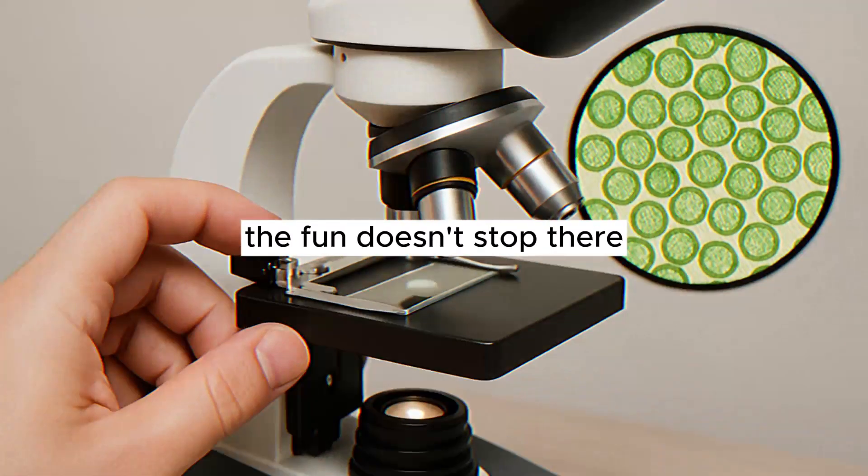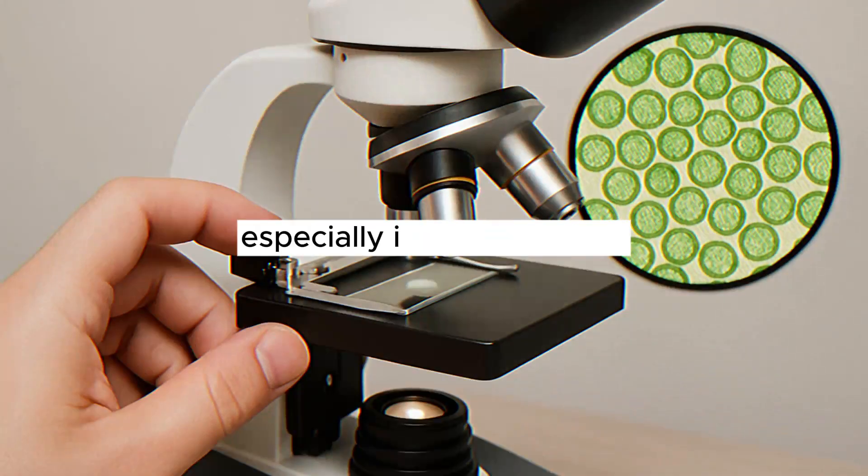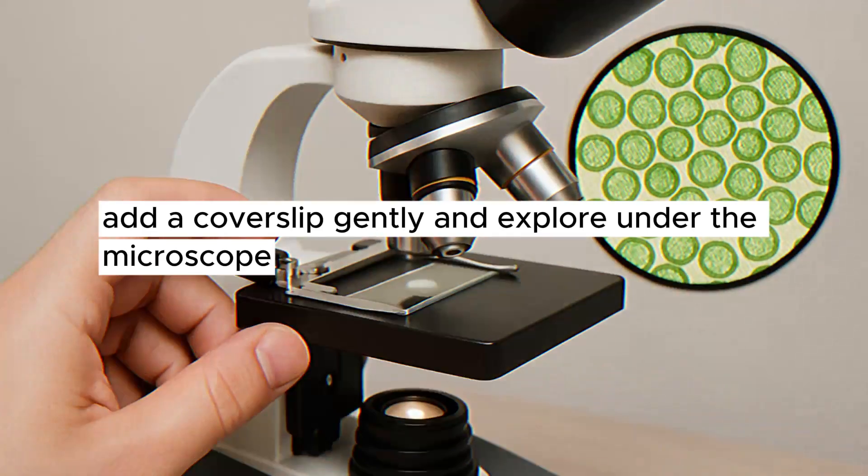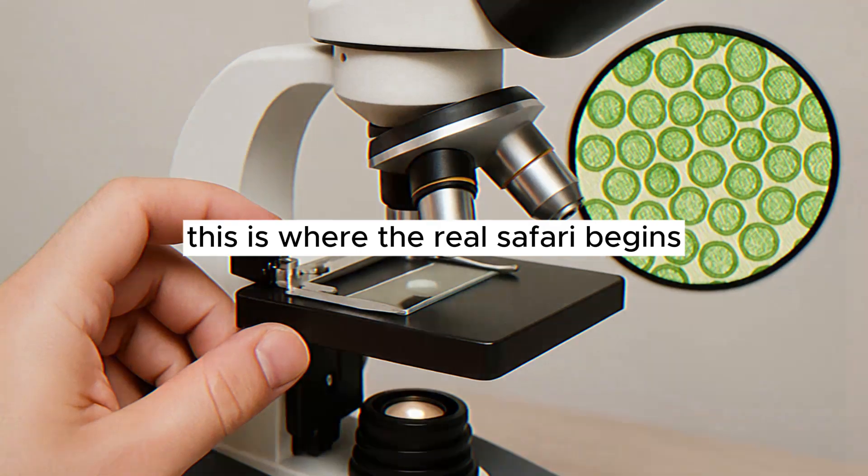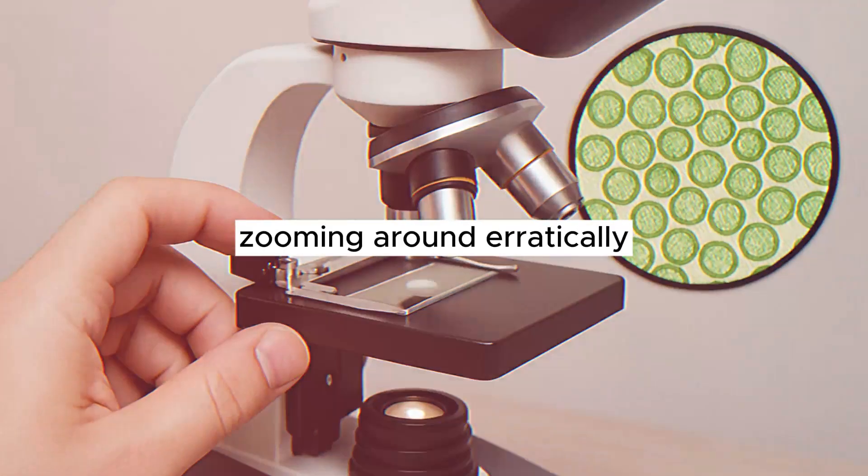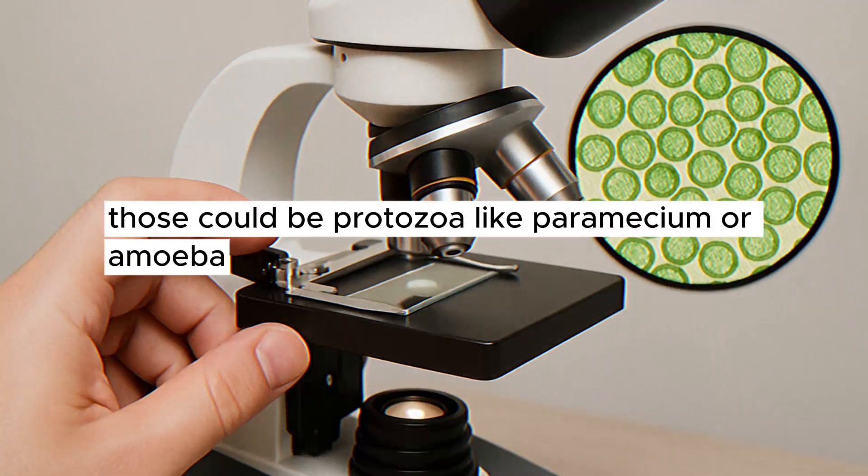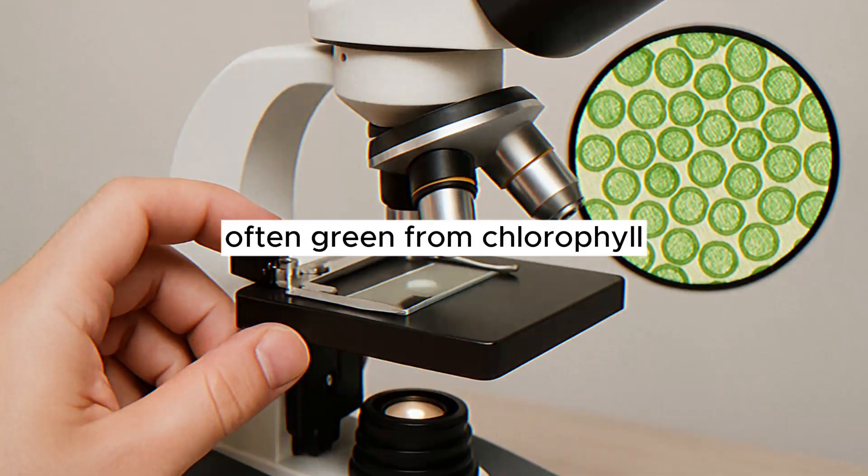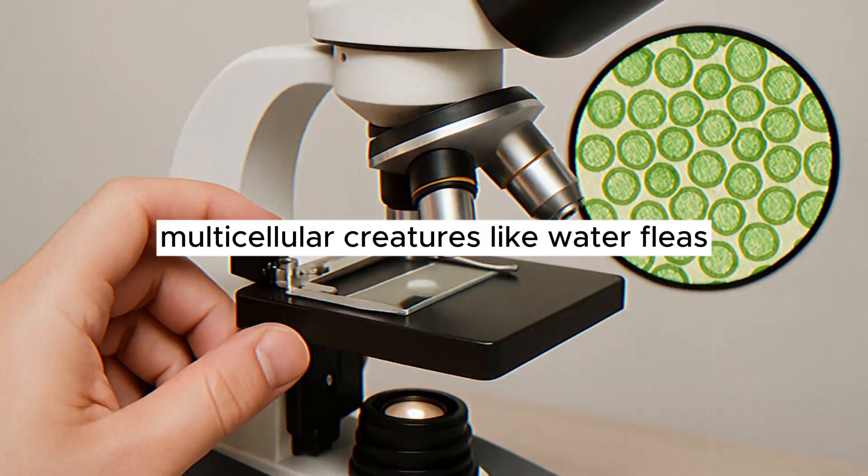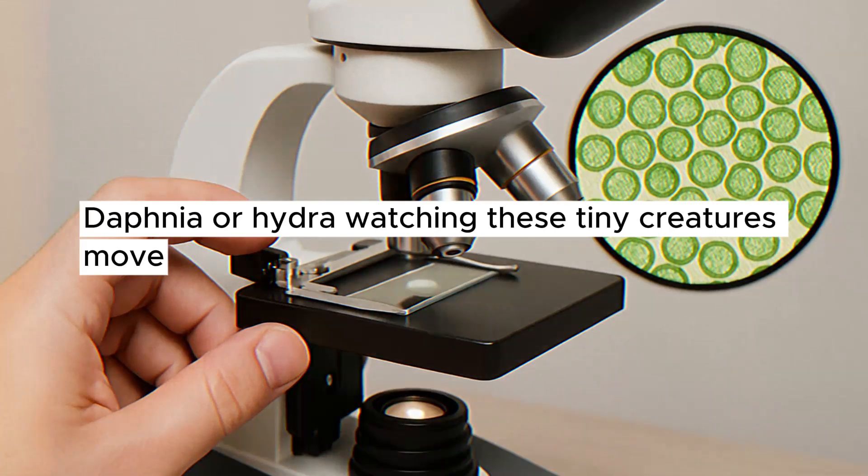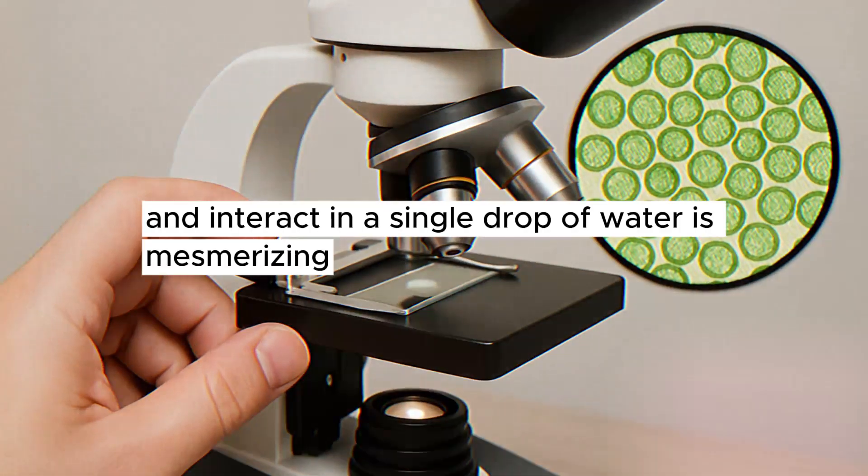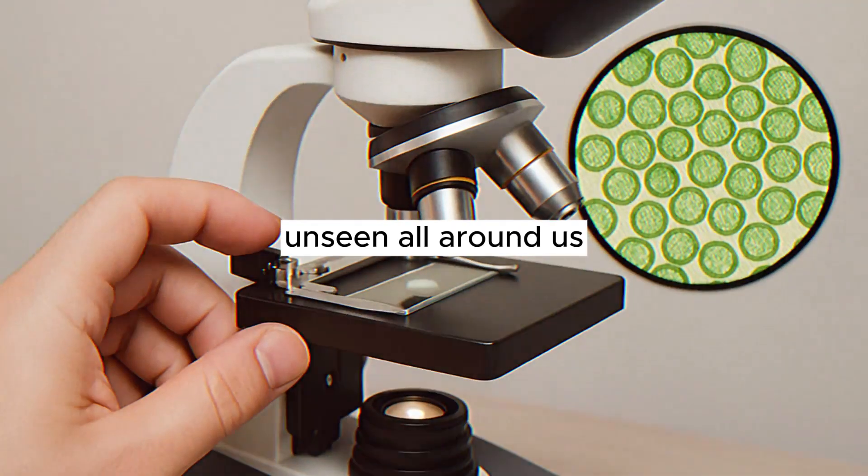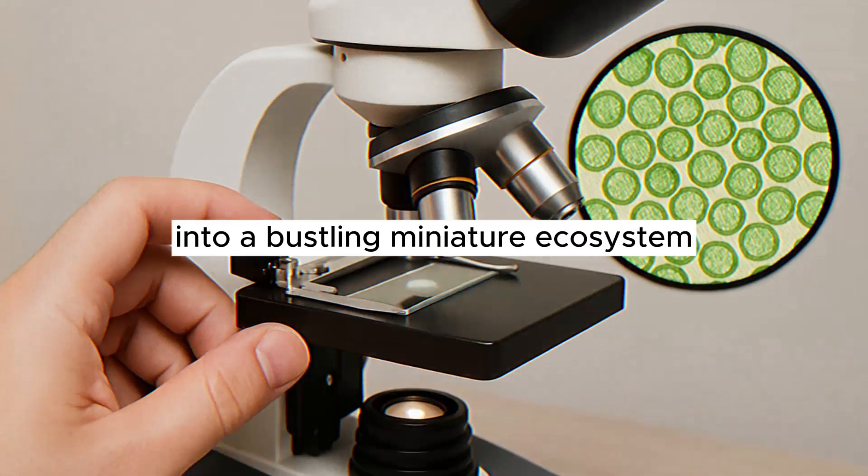The fun doesn't stop there. Grab a drop of pond water or water from a flower vase, especially if it's a bit green. Put a tiny drop on a slide. Add a cover slip, gently, and explore under the microscope. This is where the real safari begins. You might zoom in and see single-celled organisms zooming around erratically. Those could be protozoa like paramecium or amoeba. You might see algae, which could be single cells or chains of cells, often green from chlorophyll. You might even see tiny multicellular creatures like water fleas, daphnia, or hydra. Watching these tiny creatures move, feed, and interact in a single drop of water is mesmerizing and really drives home how much life exists unseen all around us. The microscope transforms that ordinary drop into a bustling miniature ecosystem.